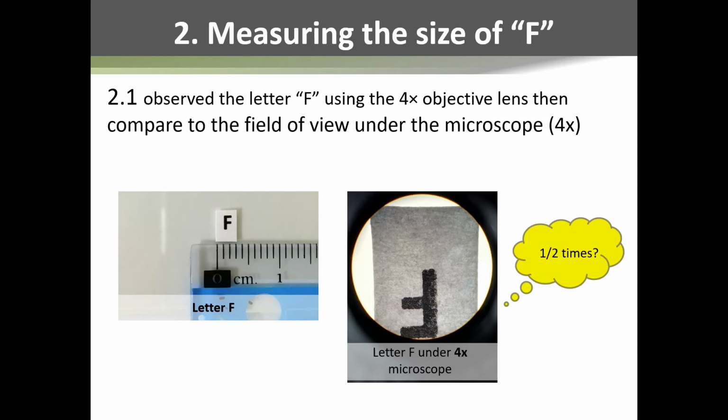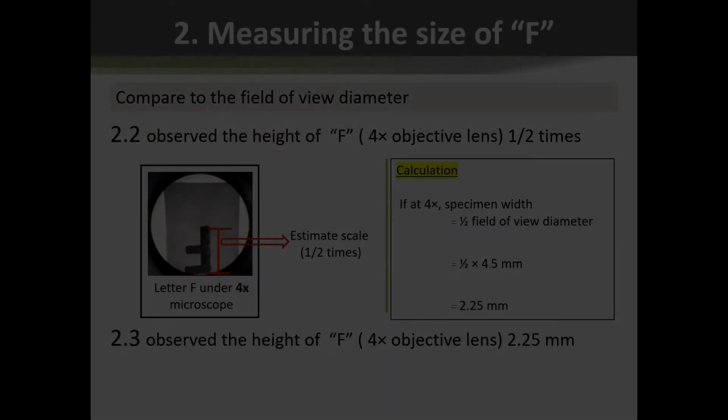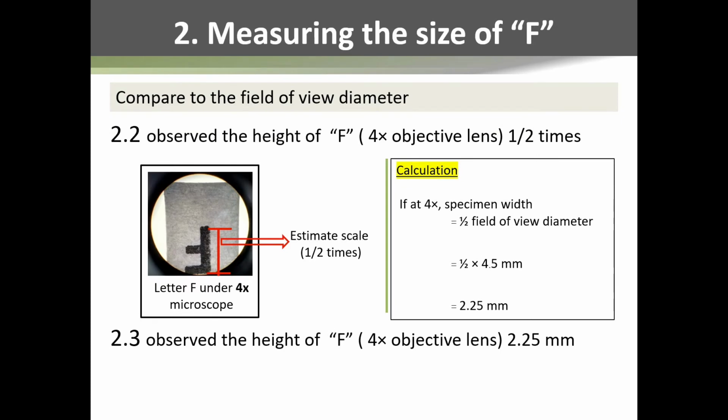What is the height of the letter F in comparison to the field of view diameter? For example, is the height of the letter about half of the field of view? Is it 1/4 or 3/5 of the field of view? Now, you can record the height of the letter F. It is about half of the field of view diameter as shown in the picture.